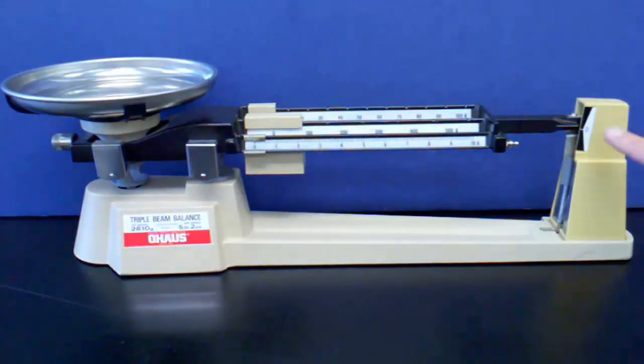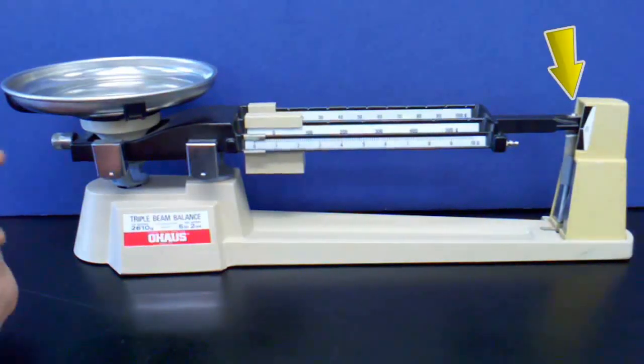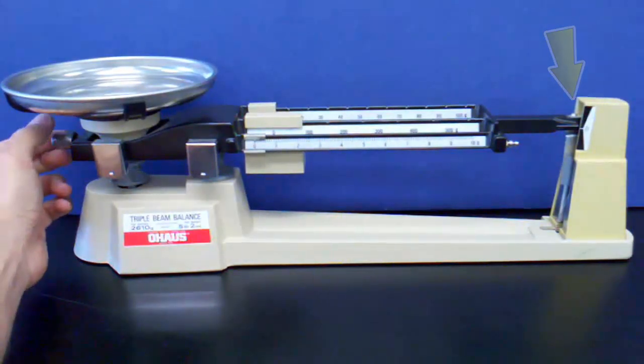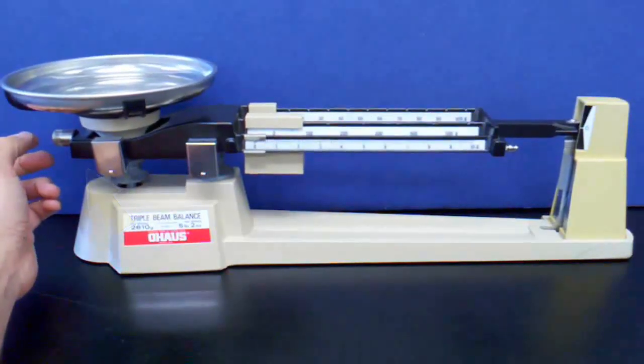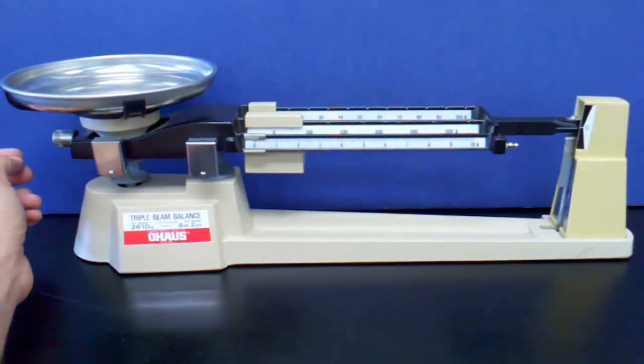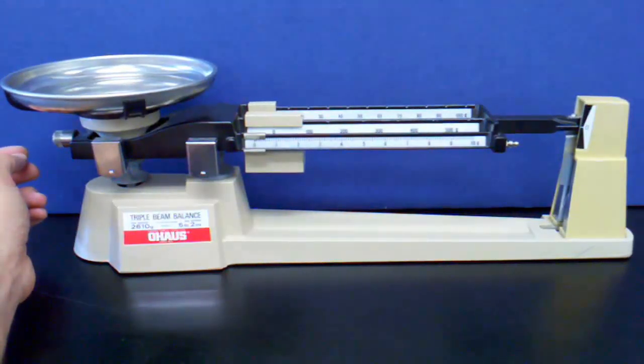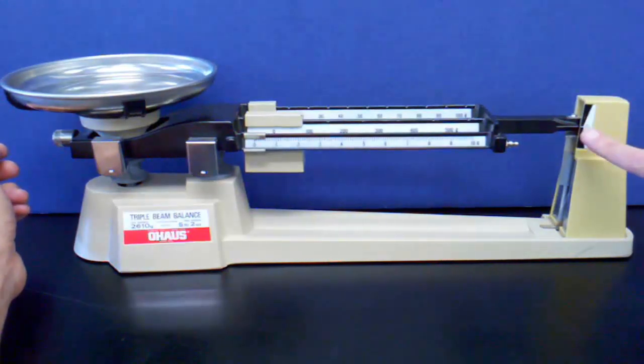The first thing to do is to ensure that the balance is zeroed. Notice that the pointer and the zero mark are not aligned. Using the adjustment knob under the pan, I screw the adjustment knob in or out until the pointer aligns with the zero mark at the other end of the balance.